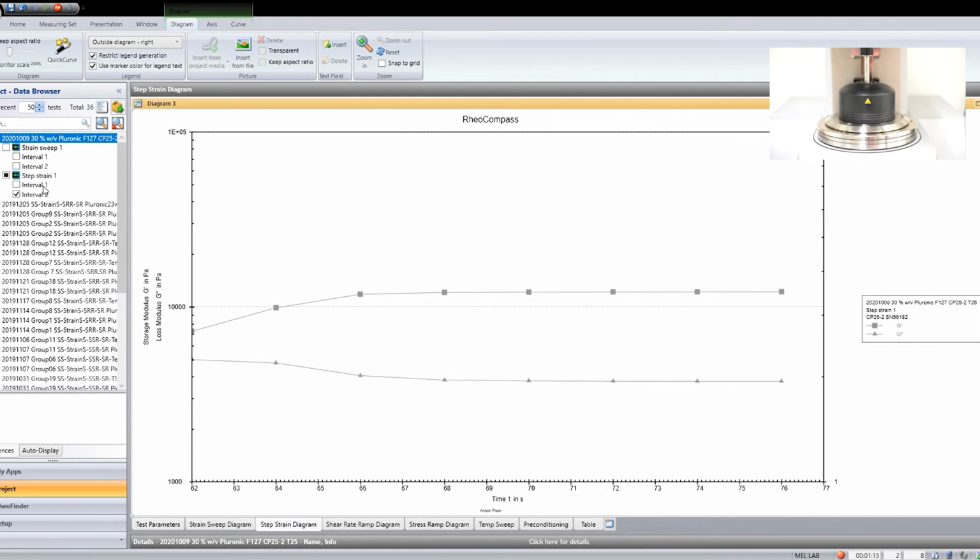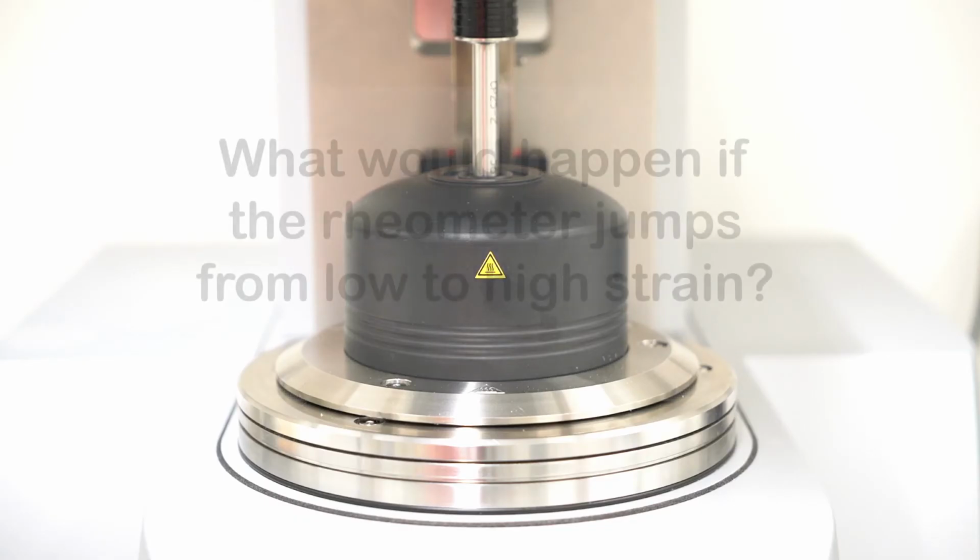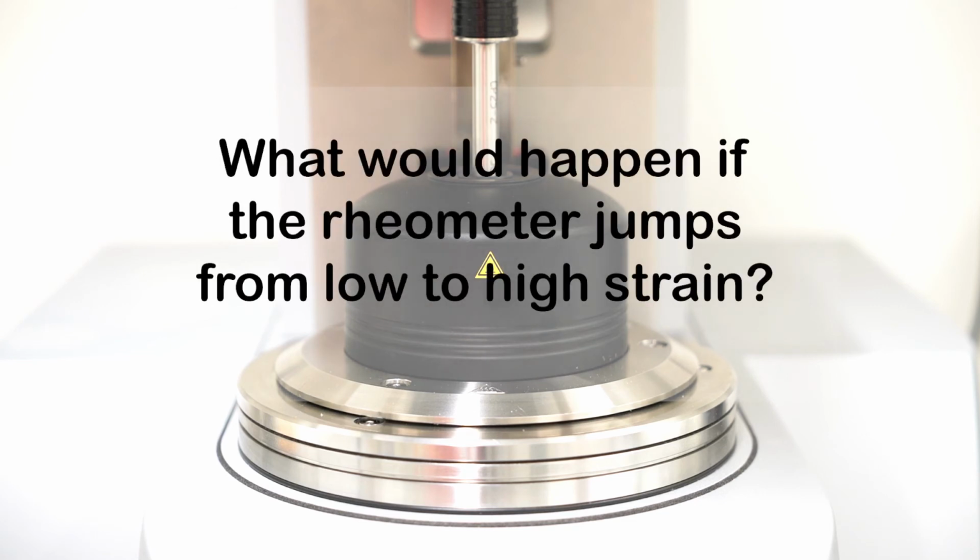At the beginning of the measurement, we see that both storage and loss moduli are at fixed values. Based on what you have seen in the previous test, try to sketch your prediction of what would happen if the rheometer jumps from low strain to high strain.